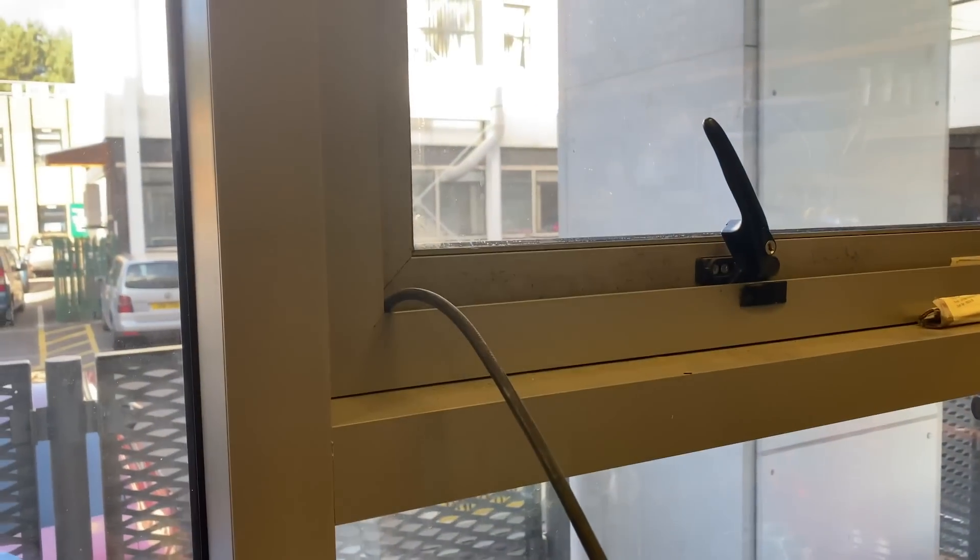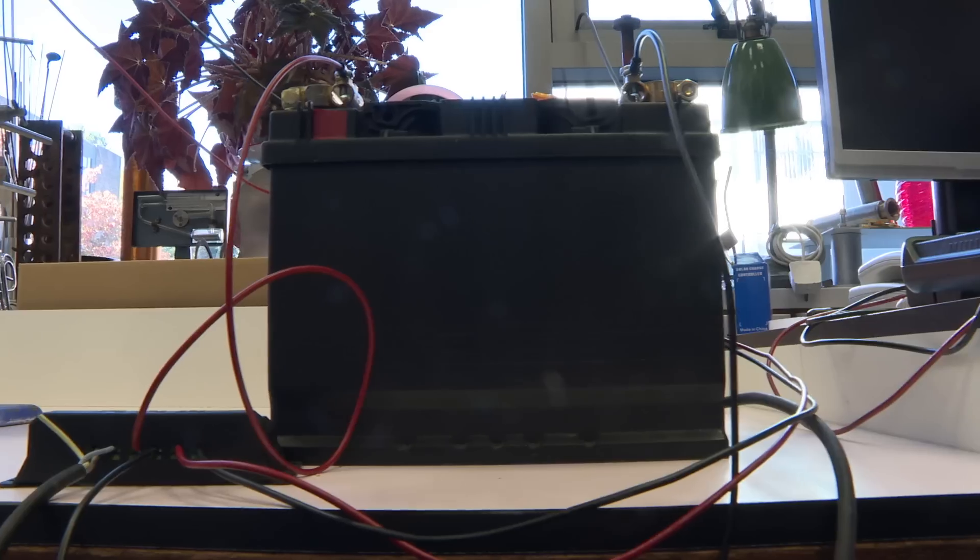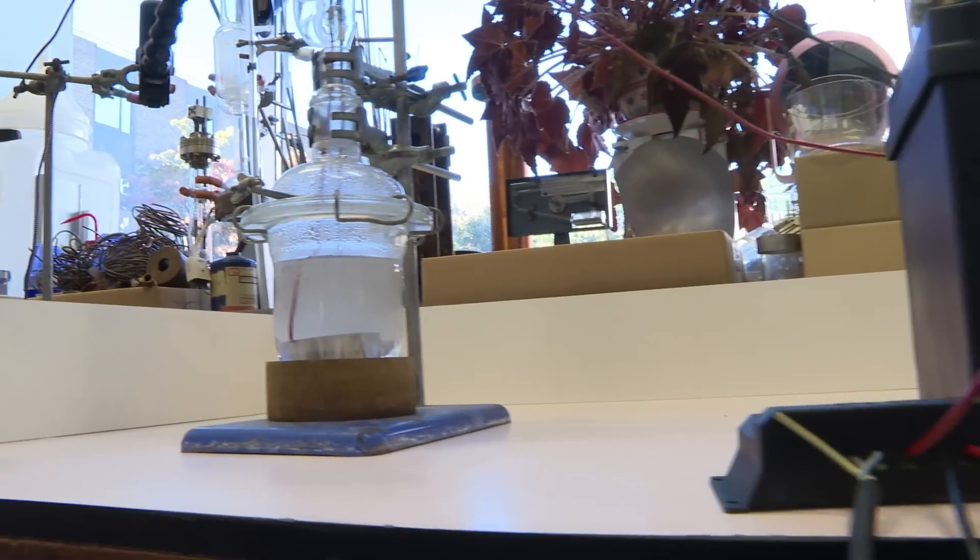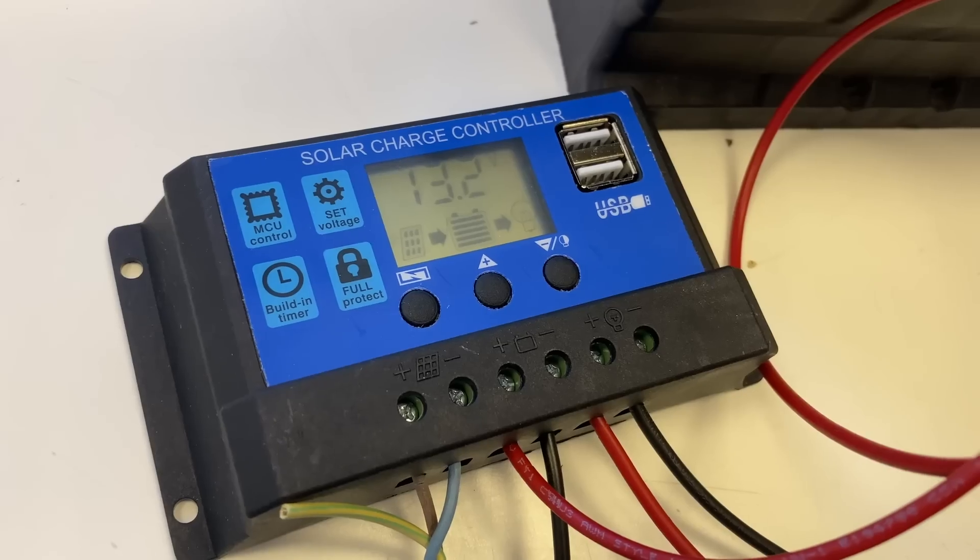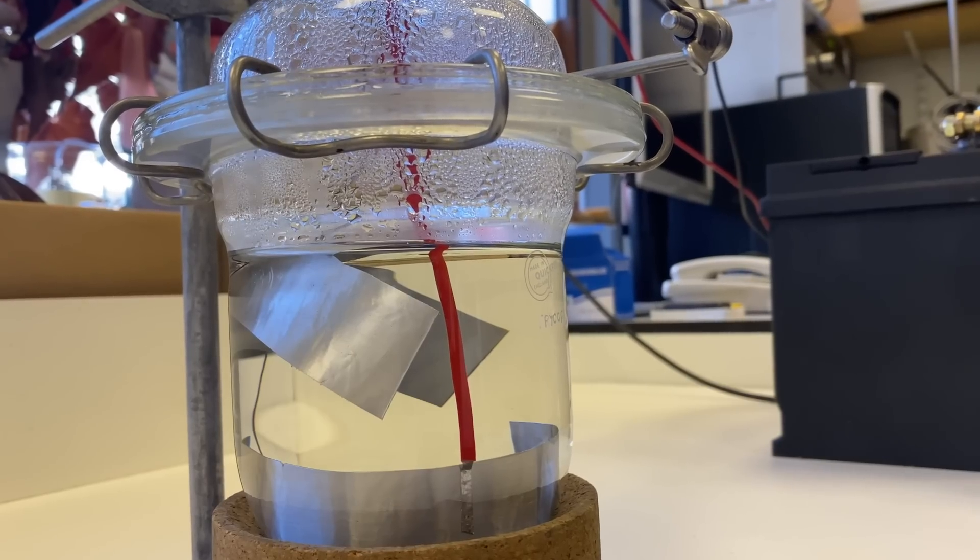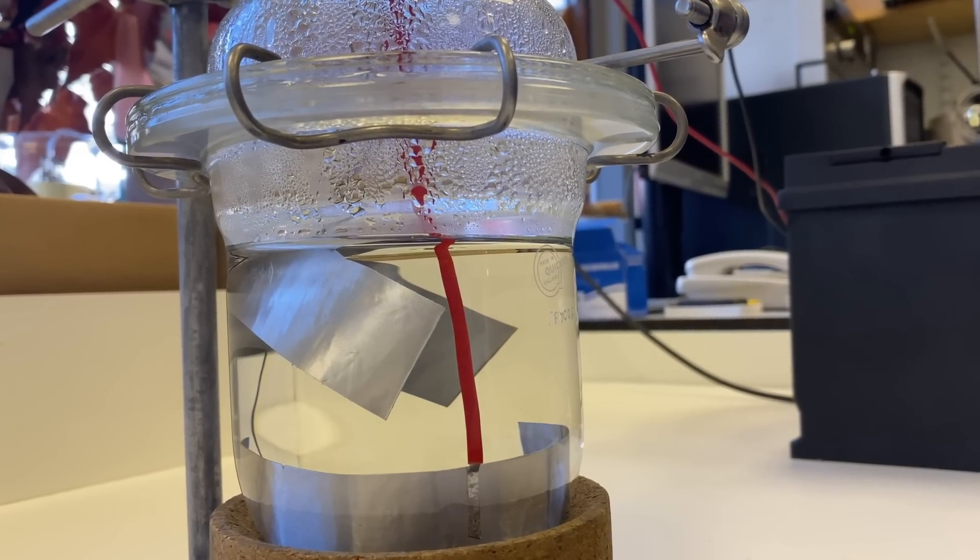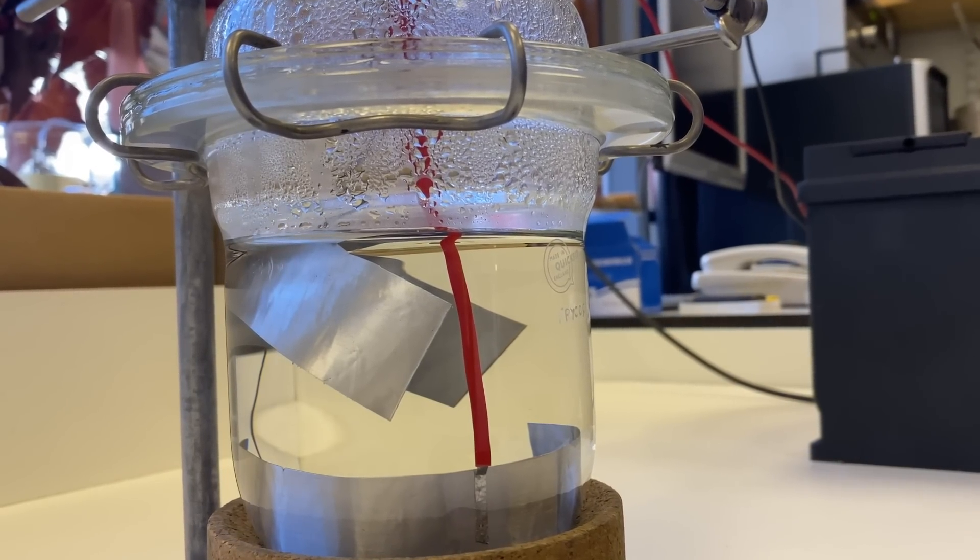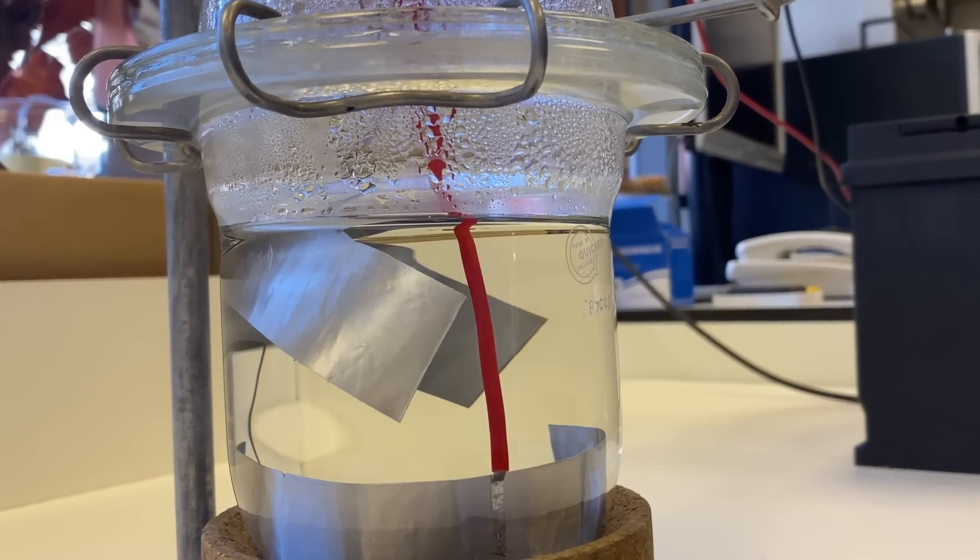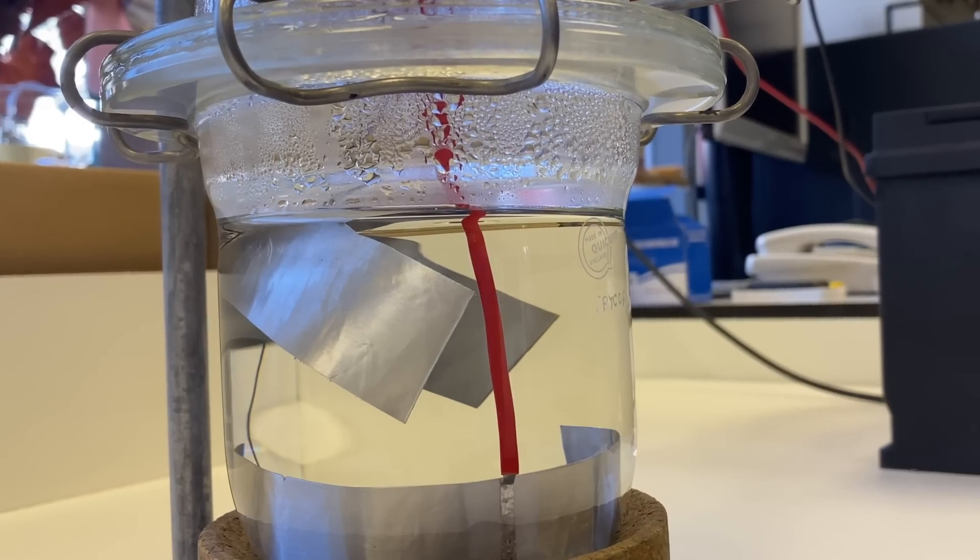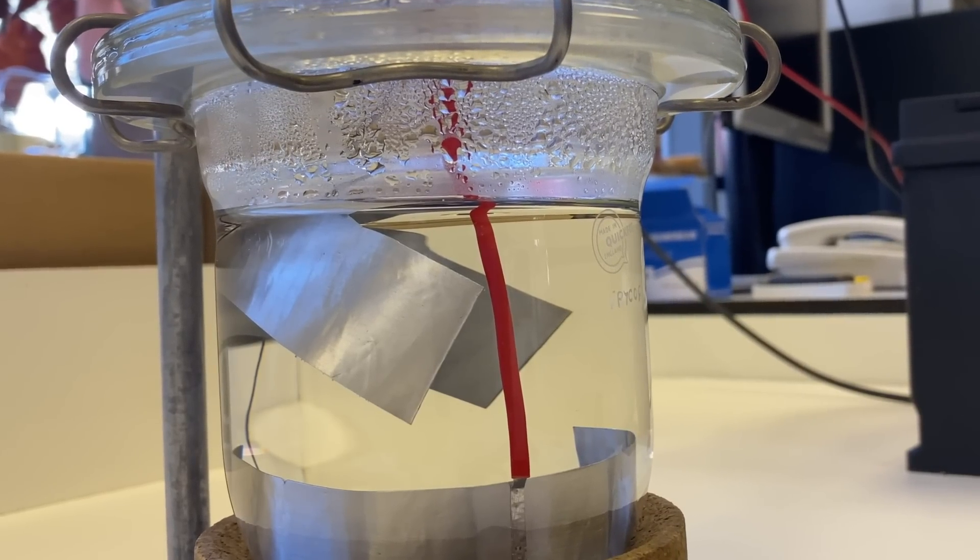And then that battery is connected to a terrific apparatus that he's built out of junk pieces of glassware that he found in the lab. Wires from the battery are attached to two platinum electrodes made out of thin pieces of platinum metal. The current goes through the water.